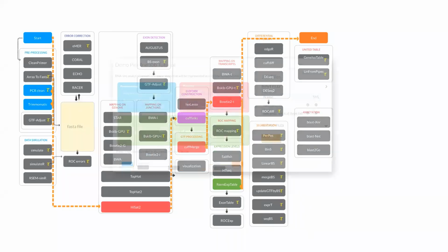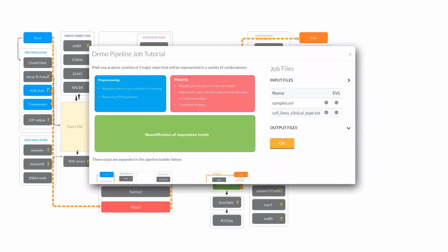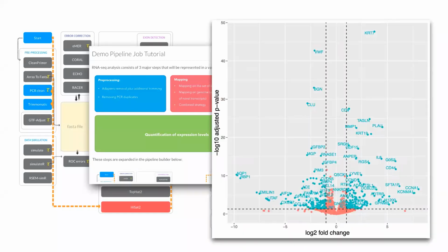In this pipeline, every step of the way, you will get an informative pop-up that explains the logic of why we are performing a certain step, discusses the inputs and outputs of every step along the way, and guides your processing so that you can understand what are the typical mistakes that you can avoid by focusing on the correct method for the correct data set with the right type of output in mind.